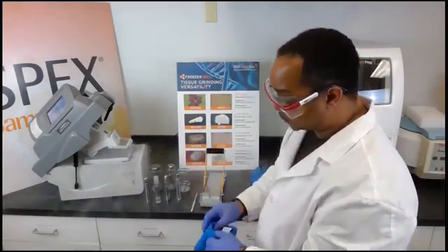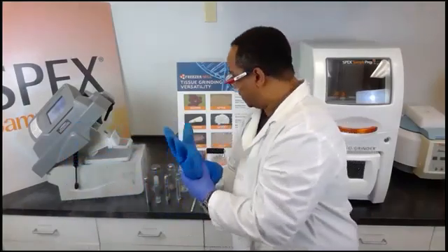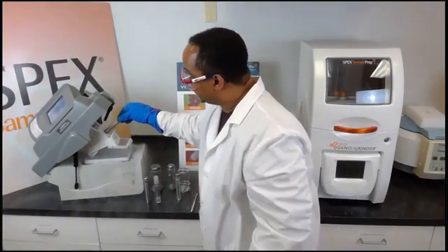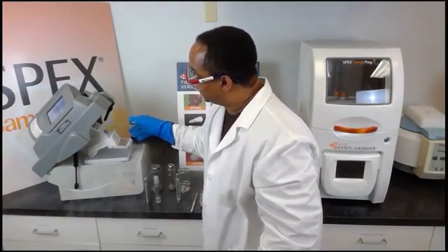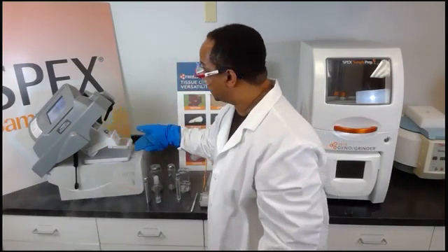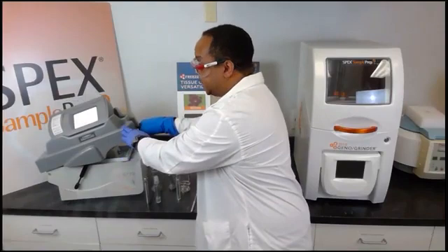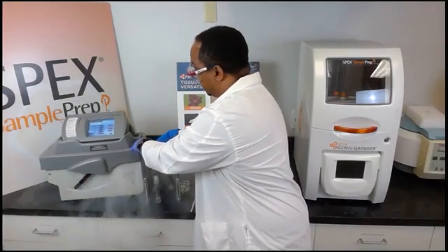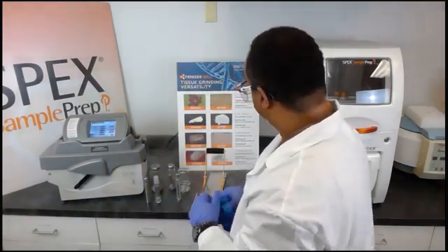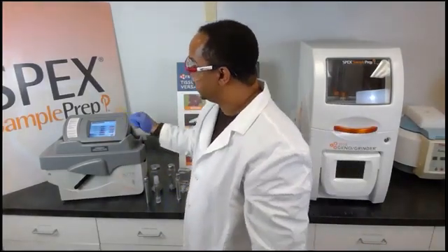To load a sample, we want to place our cryogenic gloves on. We simply take the vial and place it inside the grinding chamber, which contains the electromagnetic coils that drive the impactor back and forth. We simply close the lid slowly to avoid any splashing of liquid nitrogen. Hook and latch.